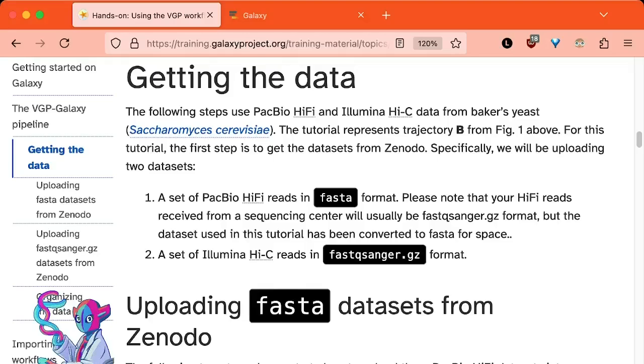The first step to assembling a genome is actually having data. We are going to be using PacBio HiFi data to create our contigs and then ARIMA Hi-C data to scaffold those contigs. Since we have HiFi and Hi-C data, we can follow trajectory B in the figure, which refers to a series of workflows best suited to analyze this data — because the VGP pipeline is set up in a very modular way.